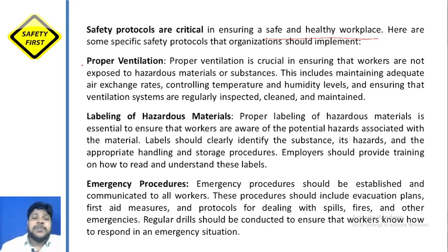क्या क्या सेफ्टी प्रोटोकॉल्स हैं उसमें, जैसे बोला प्रॉपर वेंटिलेशन. जहाँ भी कहीं आप काम कर रहे हैं तो प्रॉपर वेंटिलेशन इज क्रूशियल टू इंश्योरिंग दैट वर्कर्स आर नॉट एक्सपोज्ड टू hazardous substances. This includes maintaining adequate air exchange rates, controlling temperature and humidity levels, and ensuring that ventilation systems are regularly inspected, cleaned, and maintained.